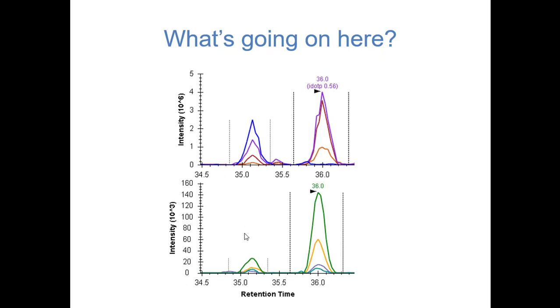So deamidated peptides are going to fall within the same precursor window because they're only shifted by 1 AMU, right? So if it's a +2 peptide, they're only going to be mass shifted by half a Dalton, half an MZ, and so they will definitely fall in the same precursor isolation window. And so we'll collect them one after another and then have to make the call, is this the peptide we're interested in or is this the peptide we're interested in? We'll talk a little bit about these concerns in a bit. But I think this is an important caveat to bring up now.